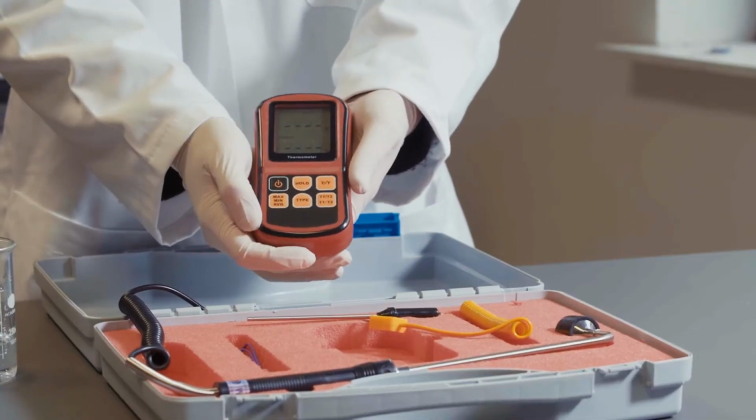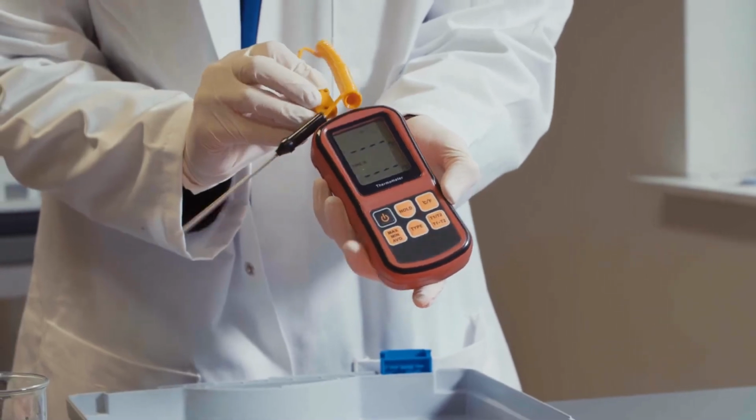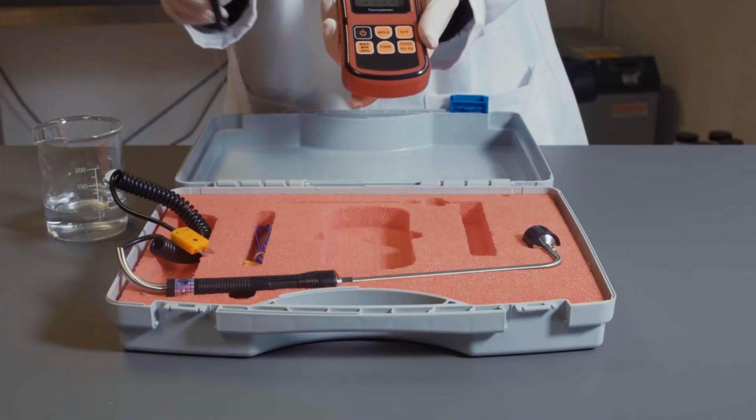To use the temperature probe, you insert the connector into the top of the thermometer and dip the probe into your sample.